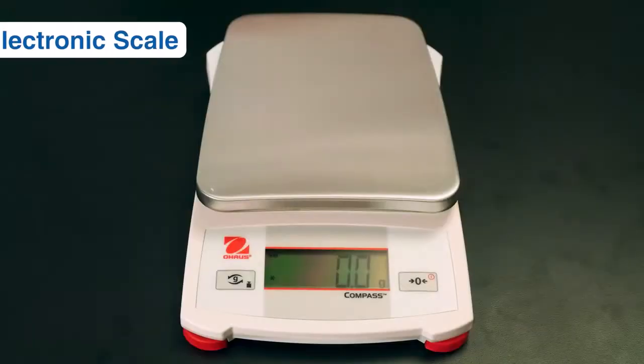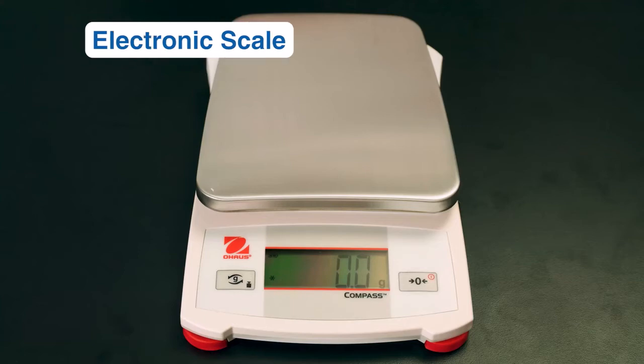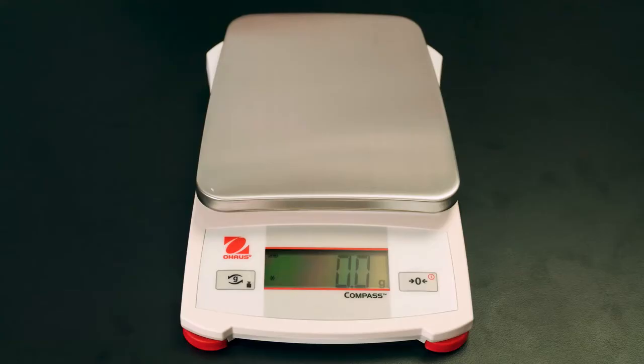An electronic scale can be used to measure weight. Unless it is being used in very unusual circumstances, a scale can convert newtons, the unit of weight, into mass because the force of gravity on an object is fairly constant everywhere on Earth. Different models of electronic scales have different levels of precision, meaning that they measure to differing decimal points. To use the electronic scale, select a scale that has a maximum mass that is greater than the item to be measured and has the desired precision. This scale has a maximum mass of 220 grams and a precision of 0.1 grams, meaning that it can measure to the tenth of a gram.